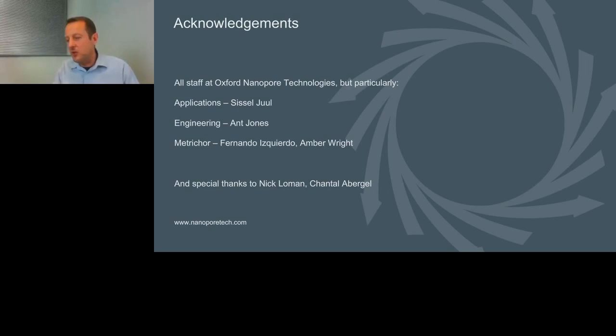As to whether you would want to customize it, it's something that we do debate quite a lot. But if you know the species that you want to put in the database, then you might be better off not using the WIMP workflow anyway. Its strength is in looking for species where you don't know what you're looking at. So for the moment, you can't customize it yourself, but it is potentially possible.